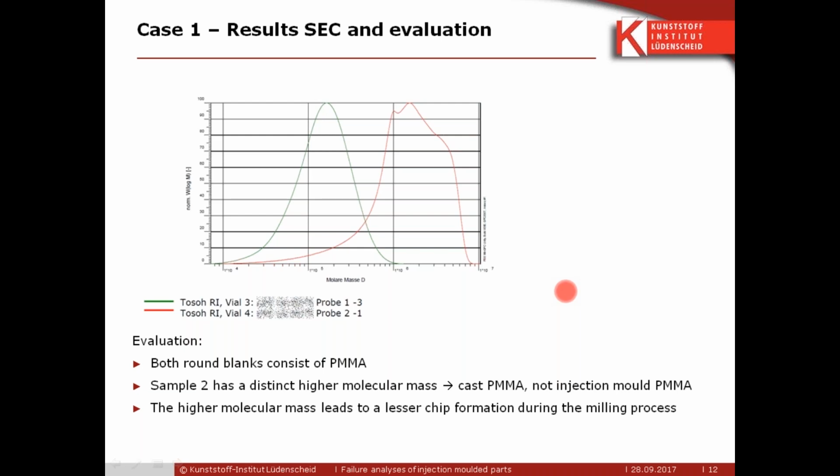It's not possible that one chain can slide easily, or it's harder for one chain to slide easily along another chain, so that will definitely make a big problem. Density is also possible, but I don't think that is it, I guess.